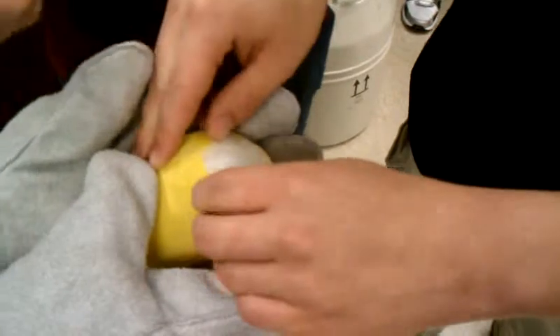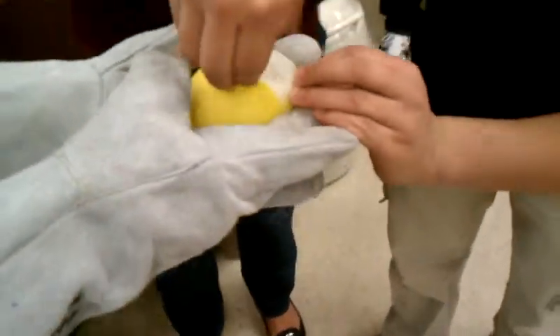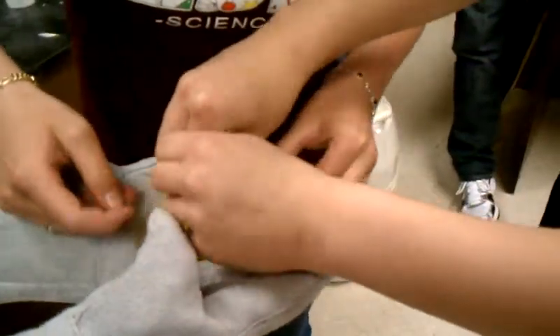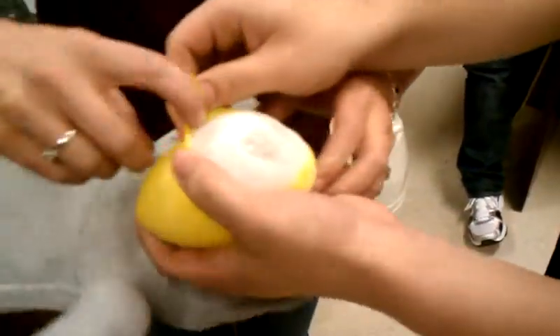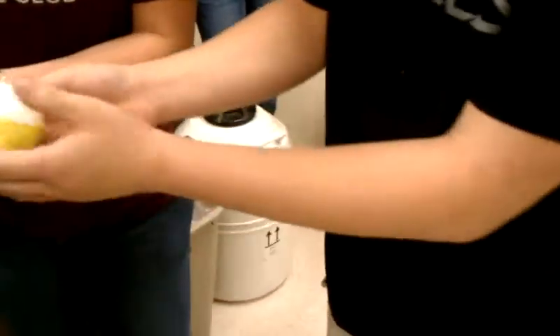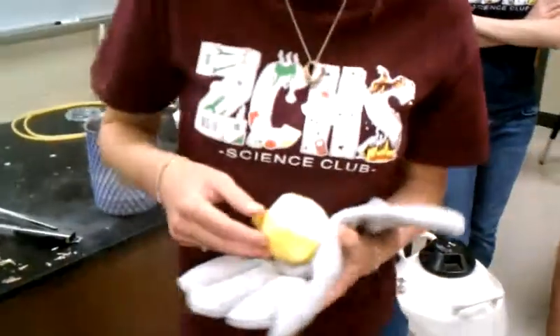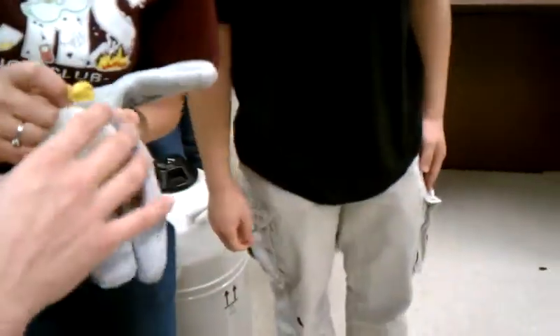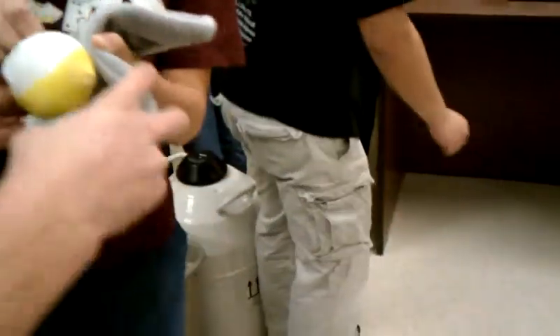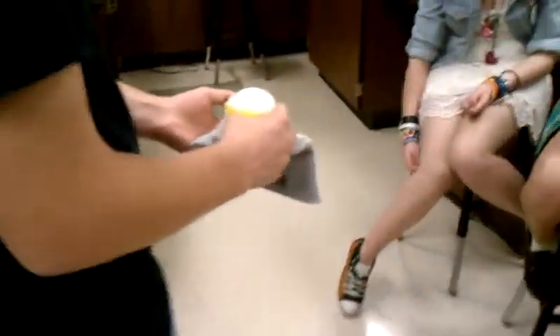Why might water still be inside of this? It's a pleasant sound. That's really cool. You're going to need the gloves to handle that. That's going to be smoking cold. Alright, go show them. Here, I'll just grab it. Does everyone see it?